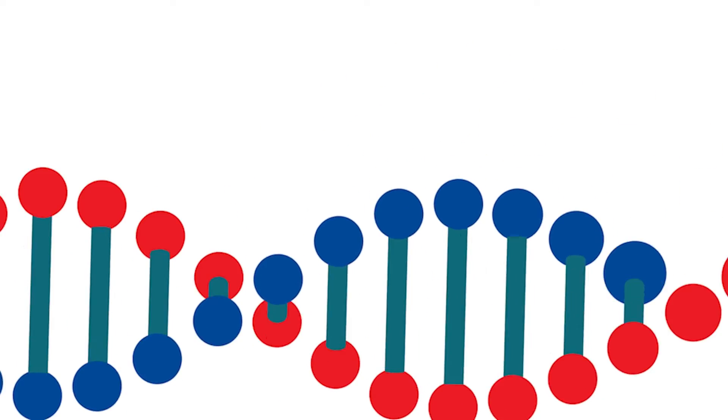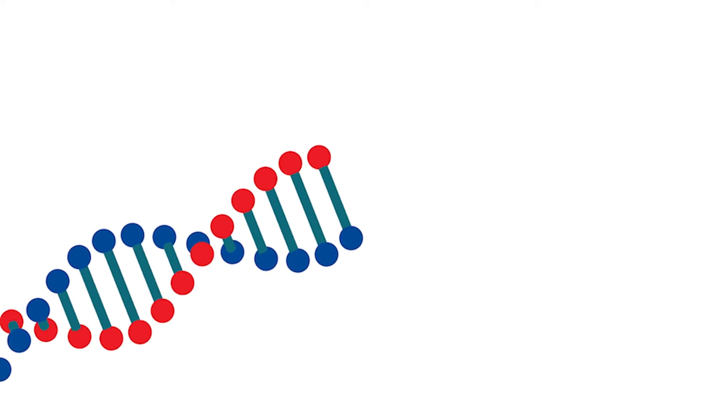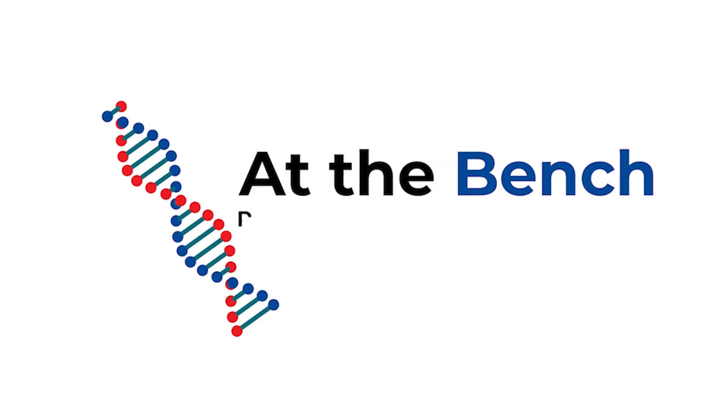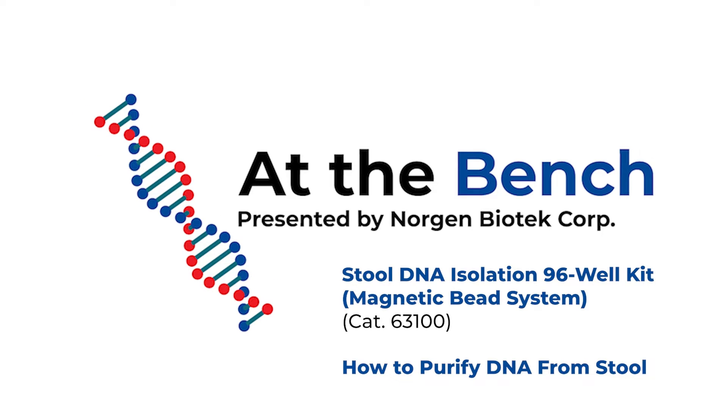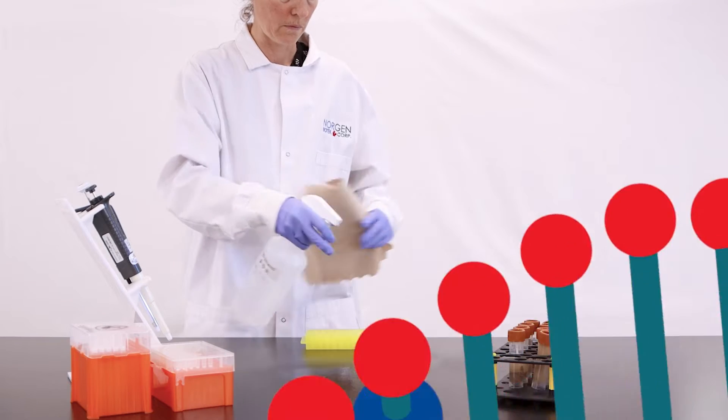Hi, you're watching At The Bench with Norgian Biotech. Today, we will be demonstrating the automated step-by-step workflow for the Stool DNA Isolation 96-Well Magnetic Bead System Kit, catalog number 63100.